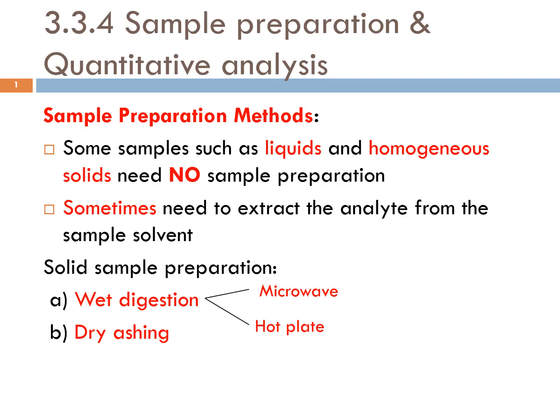Sample preparation for AAS analysis. Okay, we'll focus on the wet digestion and also dry ashing method. It is used for solid sample preparation. Okay, tapi untuk wet digestion ni untuk liquid sample pun boleh.